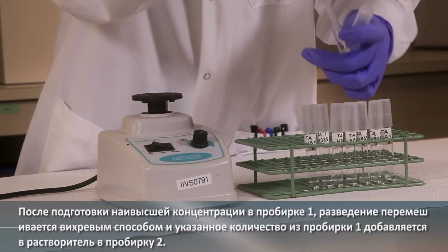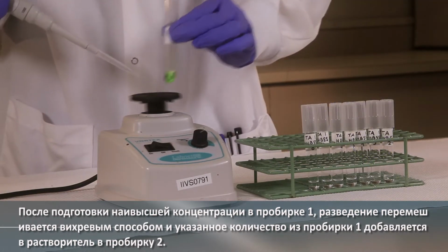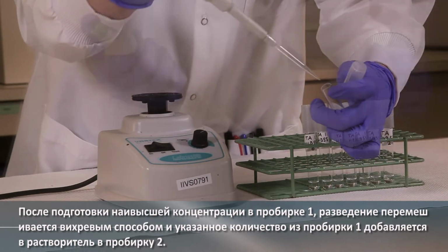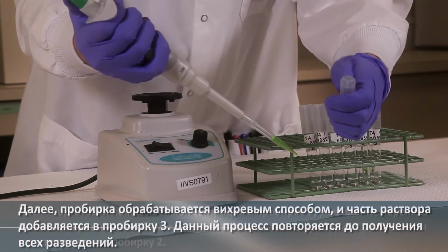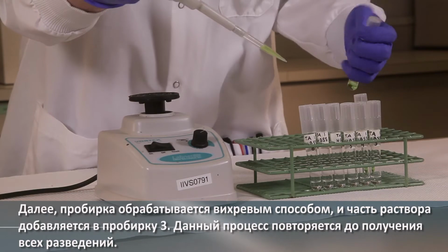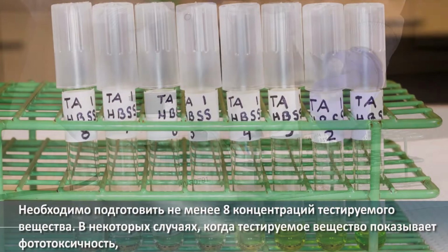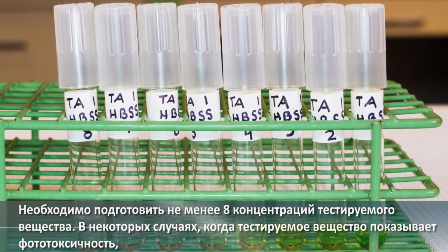Once the highest concentration is prepared in tube 1, the dilution is vortexed, and a specified amount from tube 1 is added to the solvent in tube 2. Again, the tube is vortexed and a portion is added to tube 3. This process is repeated until all dilutions have been prepared. At least 8 concentrations of the test substance will be prepared.